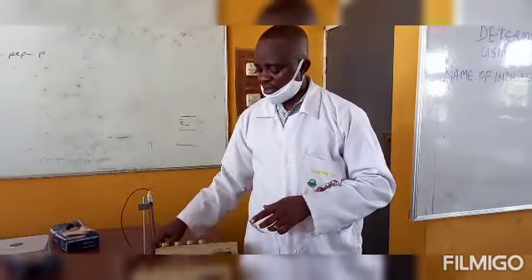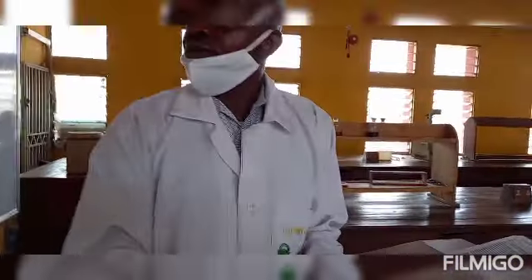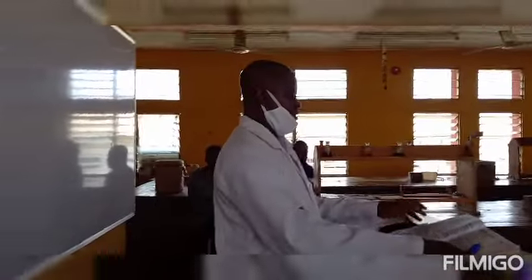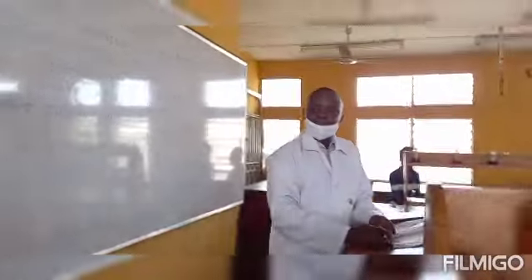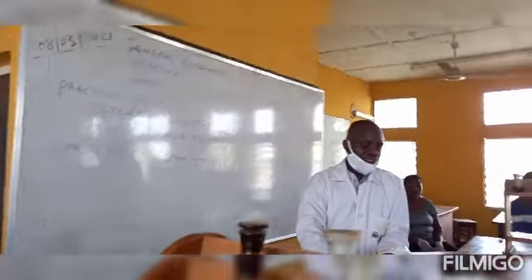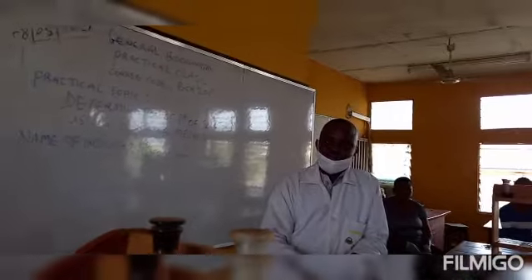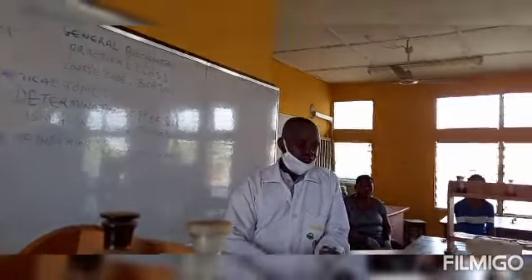So we go back to our laboratory work today, the use of bromothymol blue indicator. You have to prepare a series of 11 standard solutions in 11 different test tubes. I want you to listen carefully to the procedure.